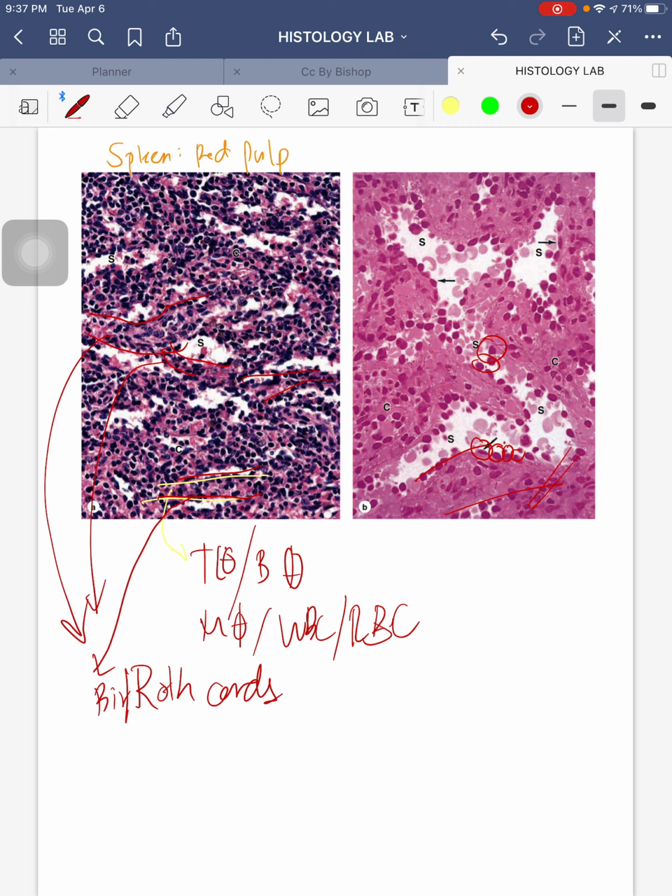They're allowed to pass through to enter circulation again. But the defective red blood cells are taken, engulfed, and broken down. That's why they call the spleen the RBC graveyard. That's why they function particularly for blood filtration. This is where your stave cells, S-T-A-V-E, endothelial cells that function for blood filtration, are.